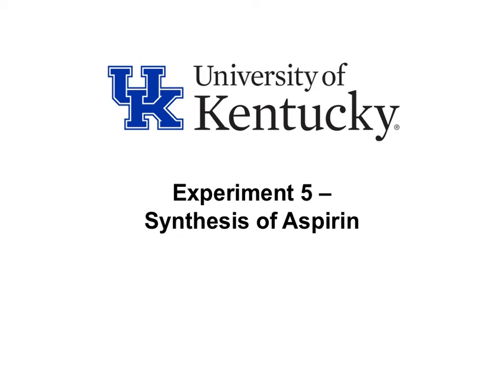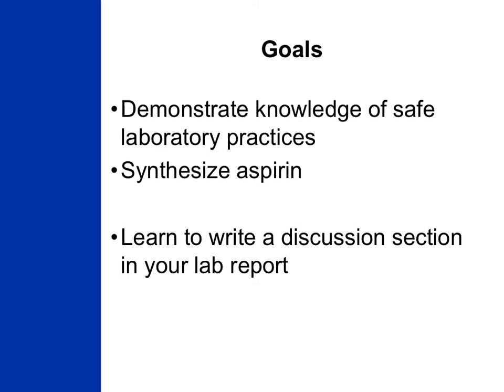In this experiment, we will be synthesizing aspirin. With this lab, we're going to continue our focus on building a laboratory safety mindset. We will be working with more concentrated chemicals this week, so it's important that you pay close attention to your TA when they go over laboratory safety procedures.